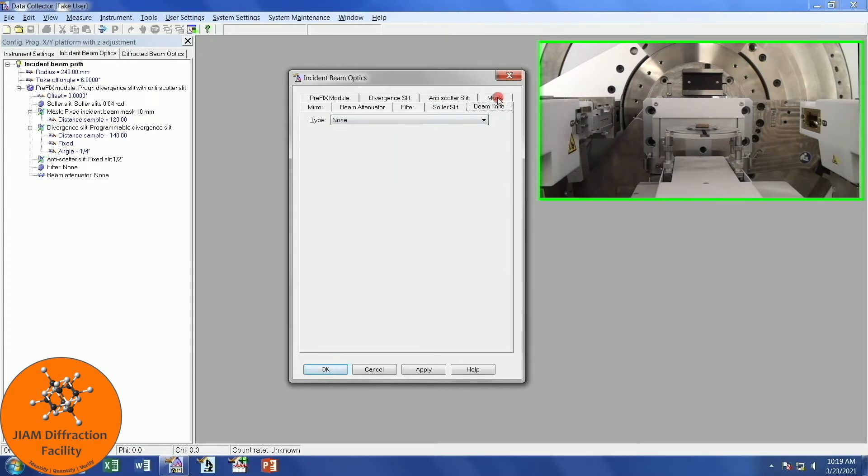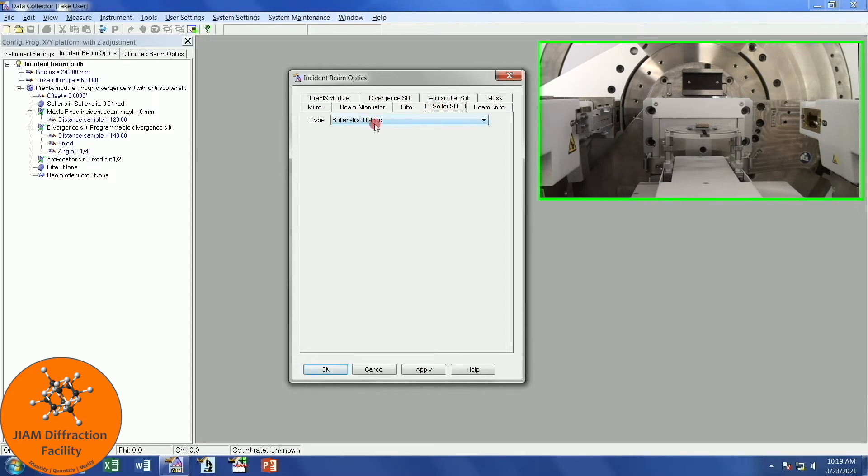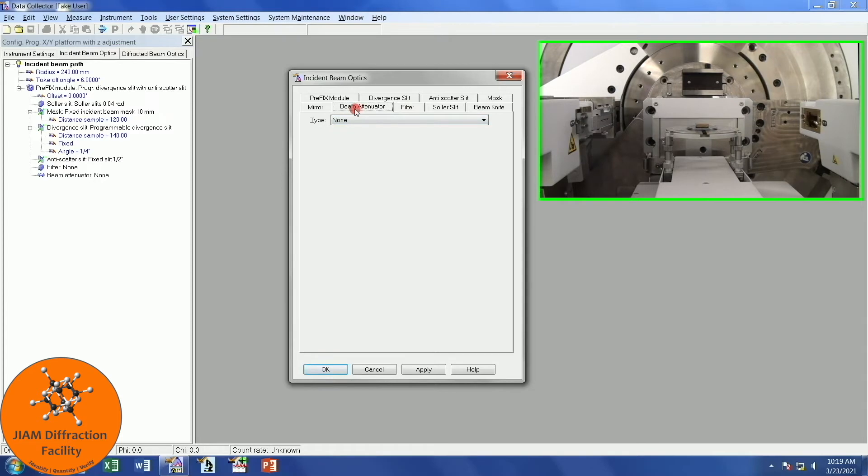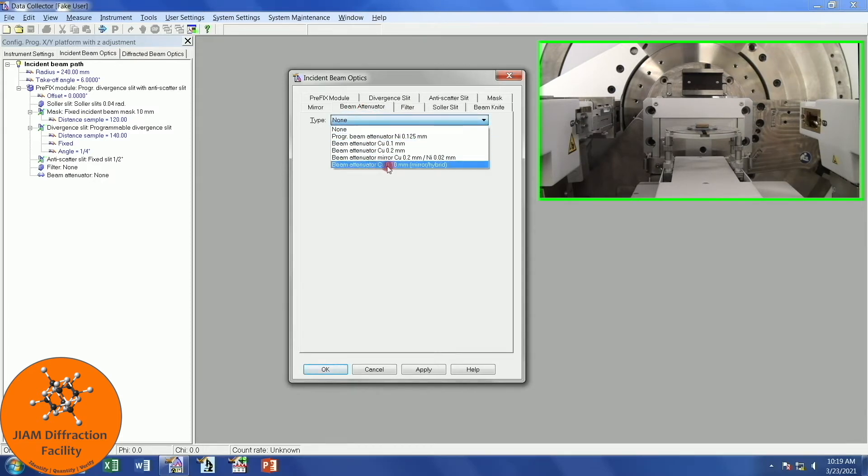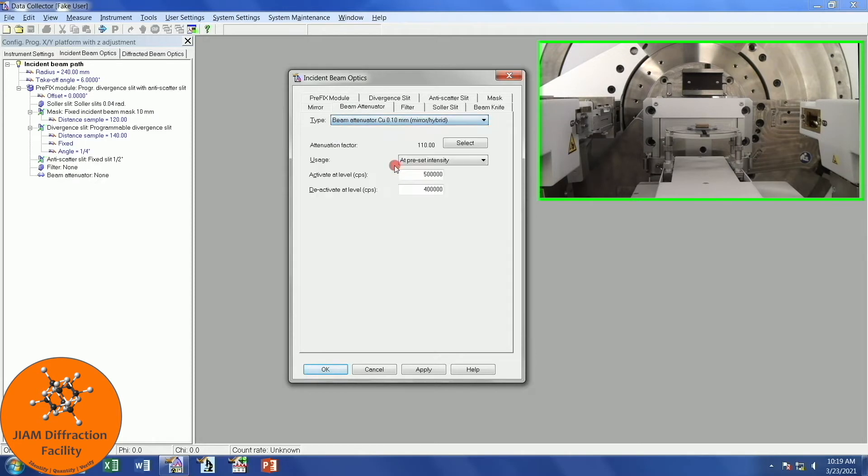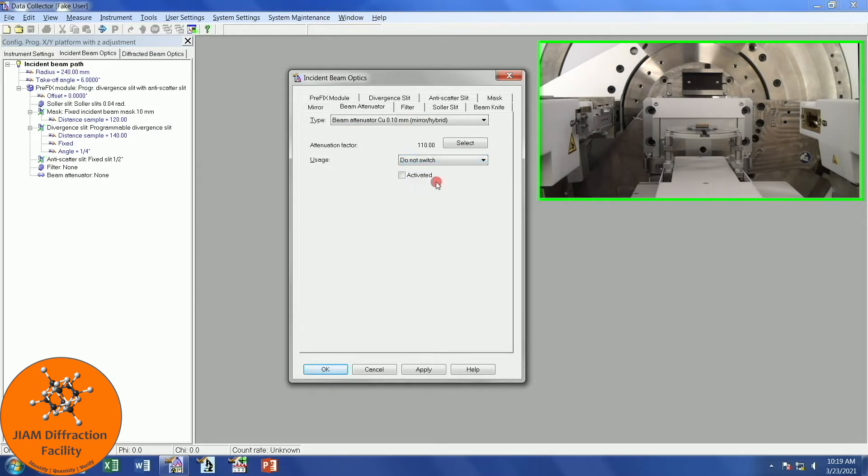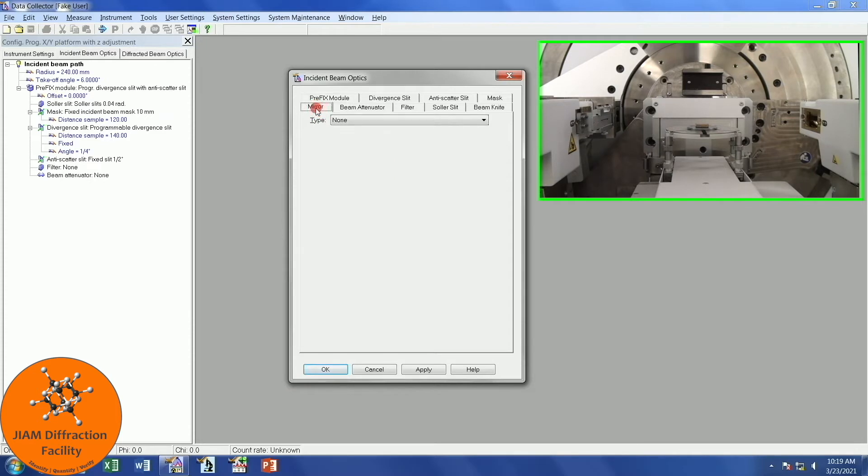You'll notice that when I click the top row, it becomes the bottom row. Beam Knife, I'm not using one, so that's none. Solar Slit, I have the 0.04 Radian. I have a filter, but it is on the diffracted beam side, so for this side, it is none. If you recall, we installed the beam attenuator earlier, so I will left-click and choose the copper point 1. Then I will choose Do Not Switch for Usage and Activated. Mirror, that's also none. I will left-click OK.